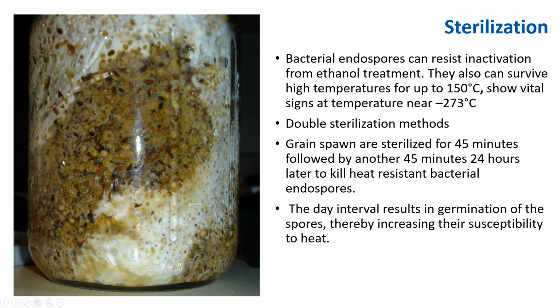This is basically a spawn that was not double sterilized at 250 Fahrenheit. You can see that this is bacterial contamination right here. This is a section where the mushroom cannot grow into.